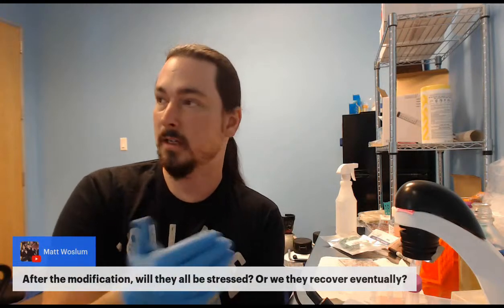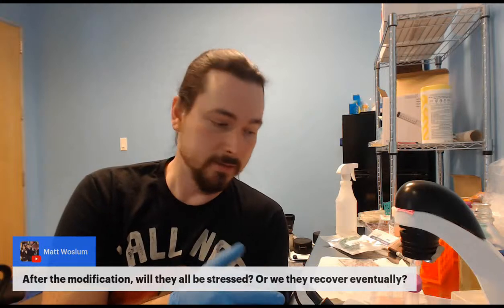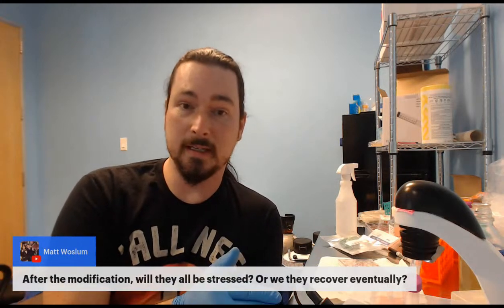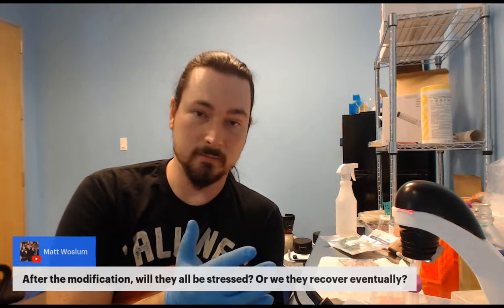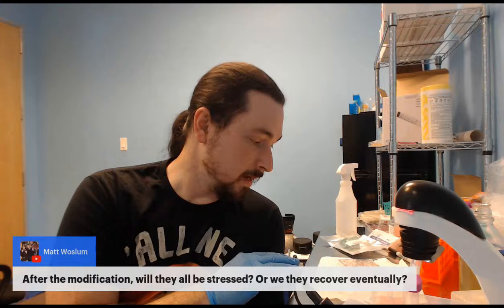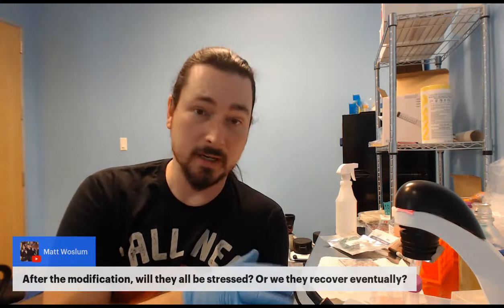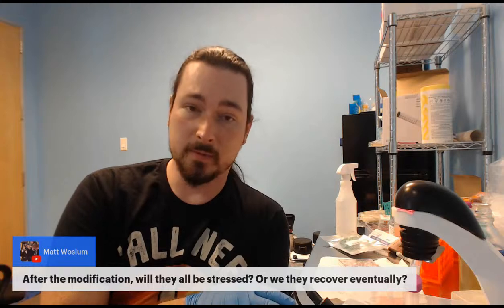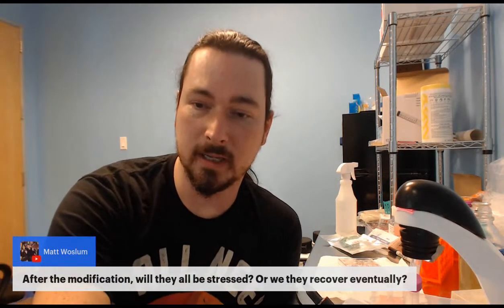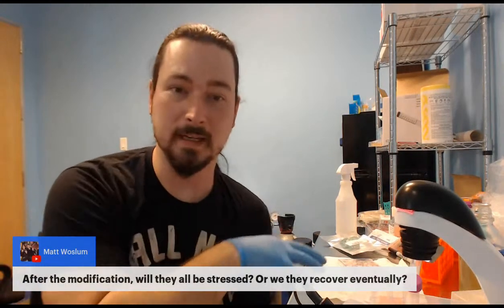If you select hard enough, you can create a stable cell line. So basically, you just modify it, and then you keep selecting, and you can keep the cells with this modification for generations and generations. But when you add the XGAL, it breaks down and is probably toxic again. If you change the media and give them some time, they'll recover from that also. It all comes down to how you treat them. They don't like being in the blue state.